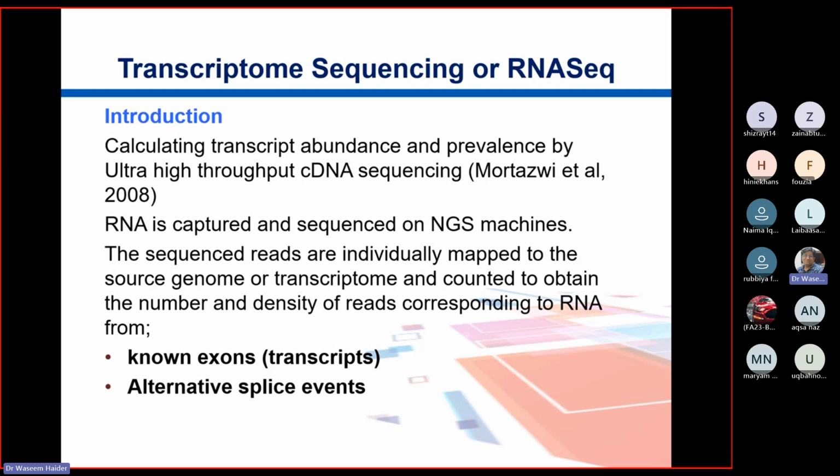So normally you have fewer genes in the database, but the number of transcripts can be like 150,000 or even 70 or 80,000. Depending upon that, I am getting a transcript which is different than yours, so you submit and I submit, and in the end, the number of transcripts becomes higher than the original number of genes.